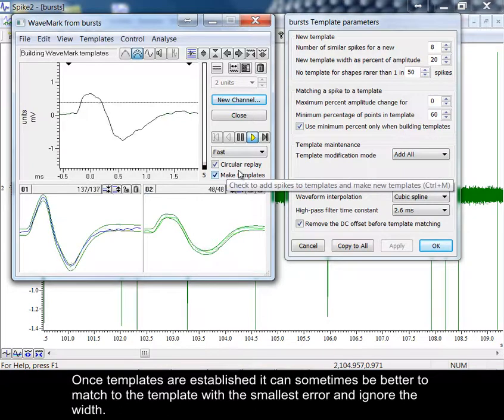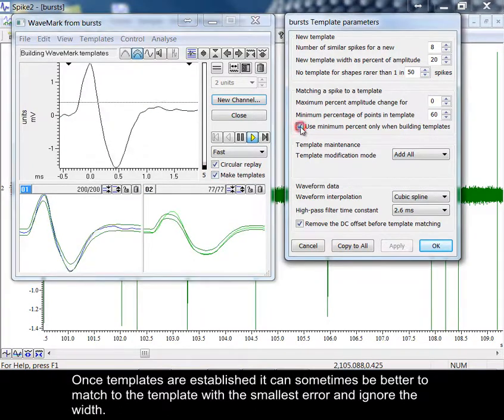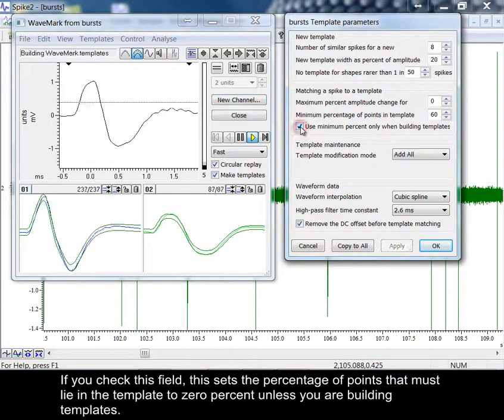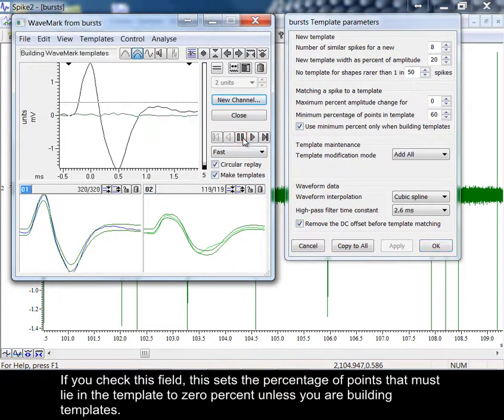Once templates are established, it can sometimes be better to match to the template with the smallest error and ignore the width. If you check this field, this sets the percentage of points that must lie in the template to 0% unless you are building templates.